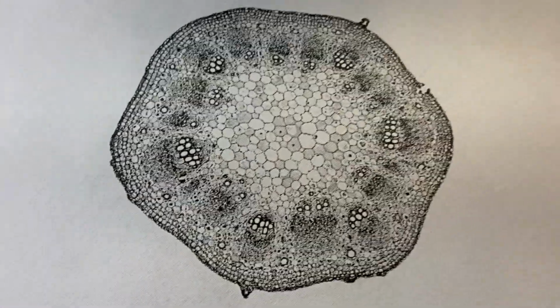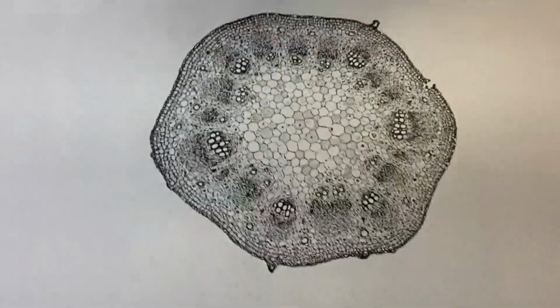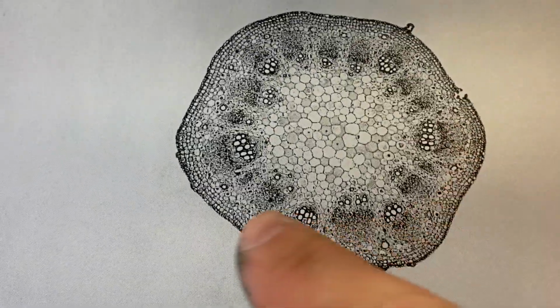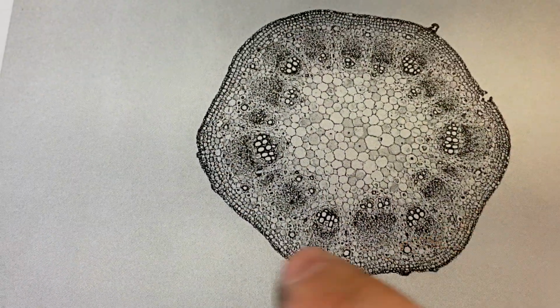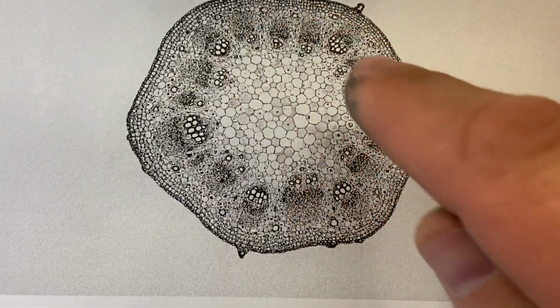The stem structure, if you were looking at it under the microscope, you'll notice a couple of things. Okay, number one, lots of cells. But look at this ring all the way around the outside. Okay, it's kind of circular in nature. Sorry about the shaking once again.